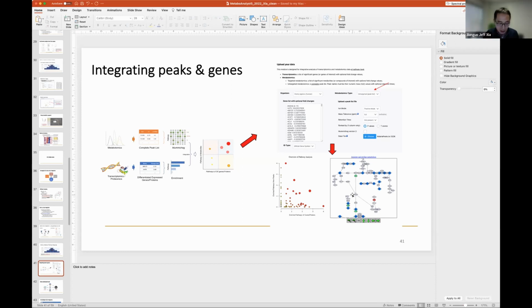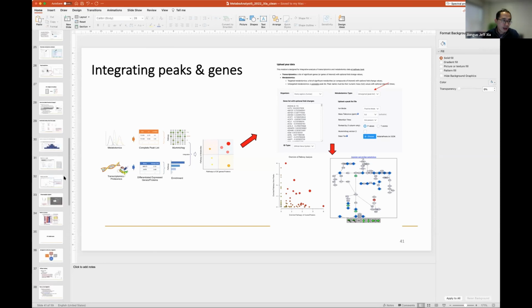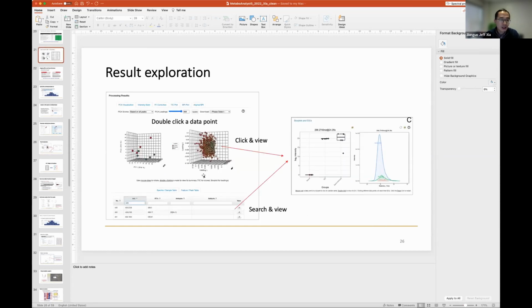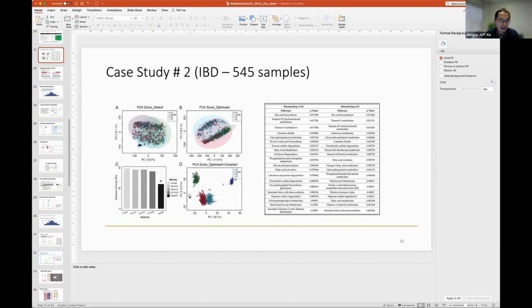Yeah, batch effect is critical, and a lot of the time the batch effect is small. Within a study, you can use some standards for normalization. You have common features, and that can potentially help. If you are really just looking for batch effect adjustment, we have a feature in MetaboAnalyst called Other Utilities, and we have about 12 commonly used batch effect adjustment methods. One of them is ComBat, and ANCOVA, WaveICA, and RUV and others.